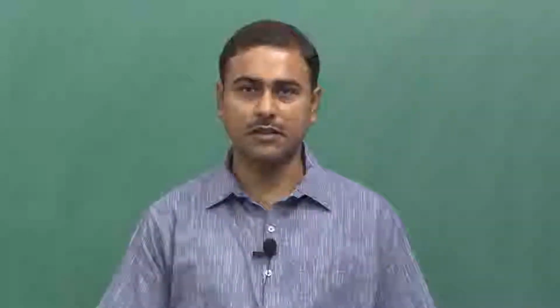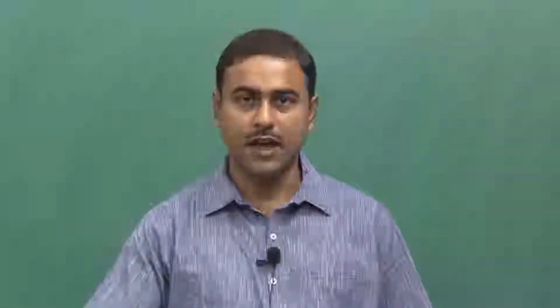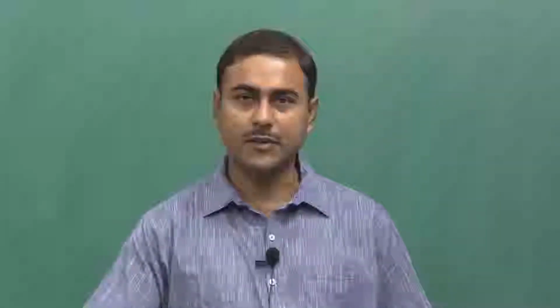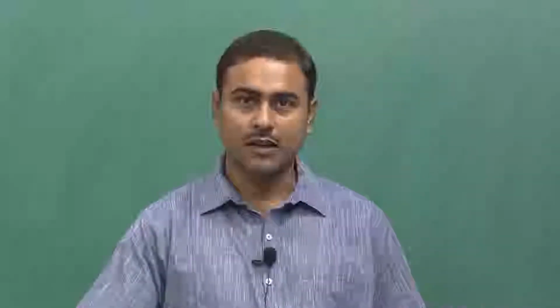Welcome to lecture number 39. So, till the last lecture, what we have done is the importance of single molecule spectroscopy, and we have shown what kind of extra information single molecule spectroscopy can give. We also have seen that a small observation volume is essential to get the information of a single molecule. So, now the question is how to achieve such a small observation volume.